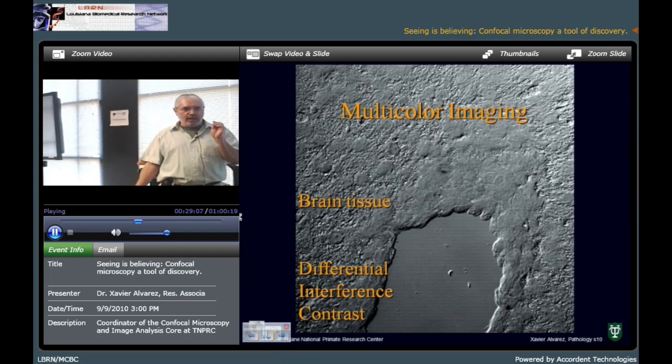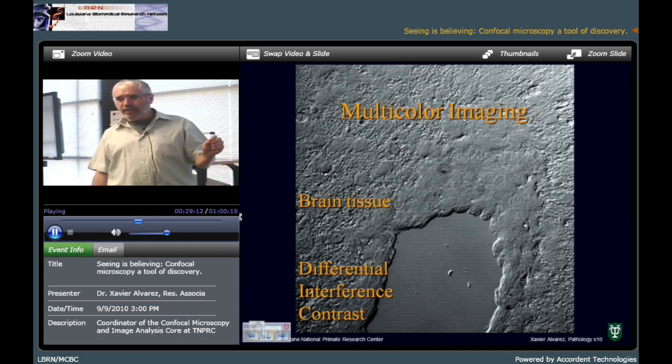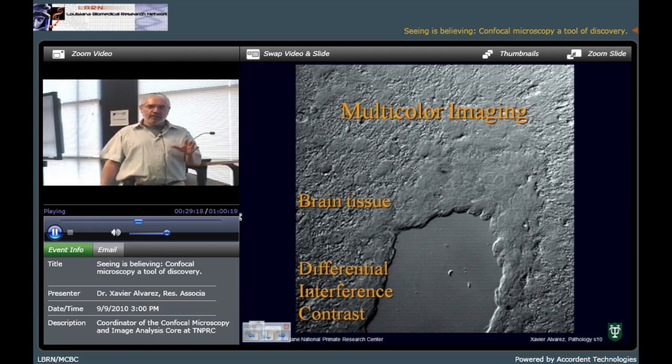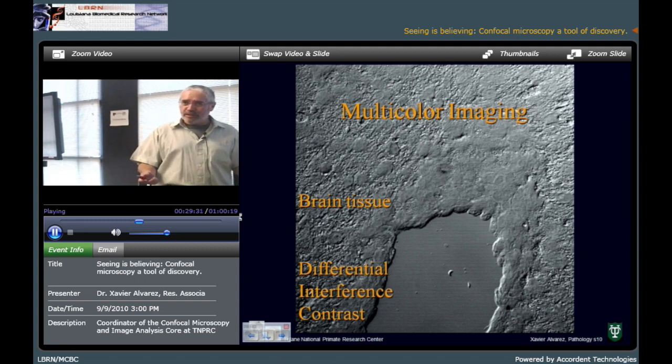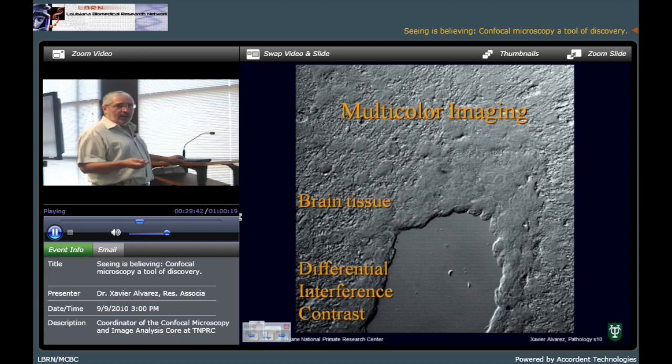One of the reasons that we have been successful doing imaging for all this time is that very soon we learned that we could combine different techniques in order to render whatever we want. There is no impediment to only using stains or only using antibodies. We could use a series of things that will fluoresce, combine them, and find out how they look and if they relate to whatever we want to show. A lot of times we find new things with this.